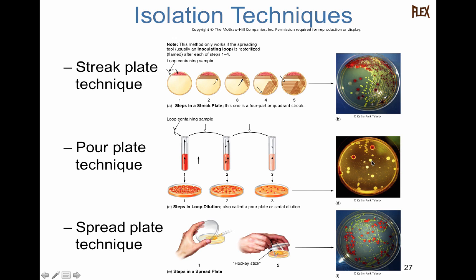So the main take home here is that when you guys look at an agar plate, and for the online crew, when you set up these experiments, and then a day, 2 days, 3 days later, you go and look at your plates and you see a colony, right? That means one single bacterial cell was introduced to that area of the plate by you, whatever you were swabbing it with, all right? Or also spread plate.